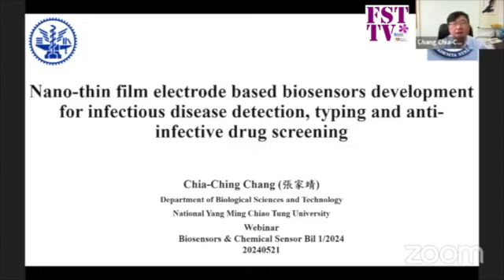At the same time, we also found some natural pairs, such as the virus and their receptors. By using this comparison, we can screen some drugs or leads which may affect those virus infections. So that's the overall outline of my talk.